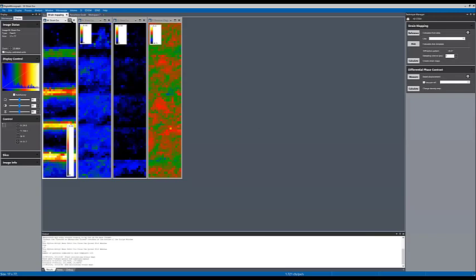And then for the point about having different areas of the sample, one strained and one strain free, I don't know if the two of you wanted to talk about that as well. There's a couple of questions. So you probably should have some ideas about your sample when you go into the microscope. You can't just go in blind.